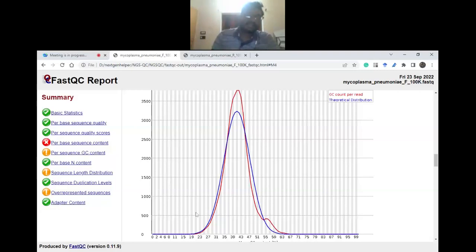Hello. Yes, sir, I have a query. The GC content per sequence shows the GC percentage of base pairs, right? G and C. In the same way, is there anything which shows AT content? You can calculate it, right? Okay.